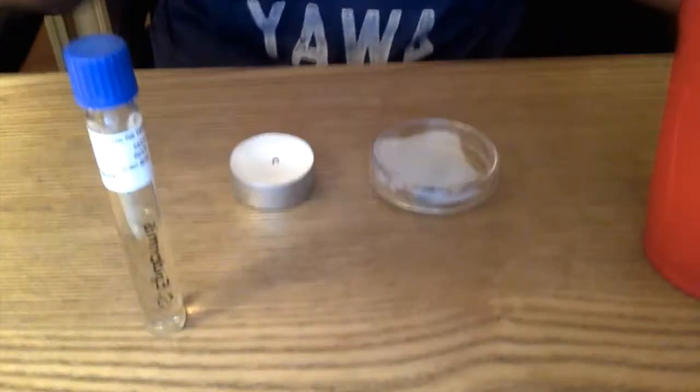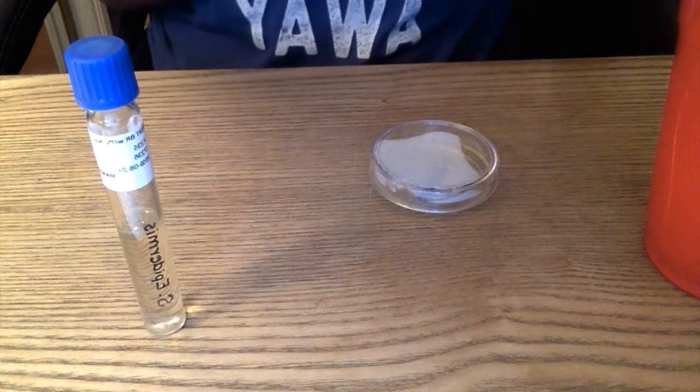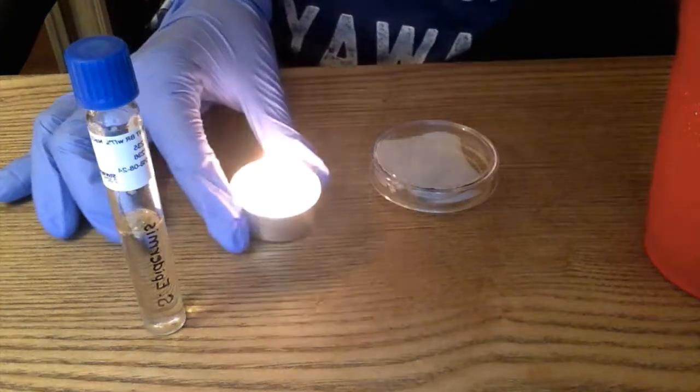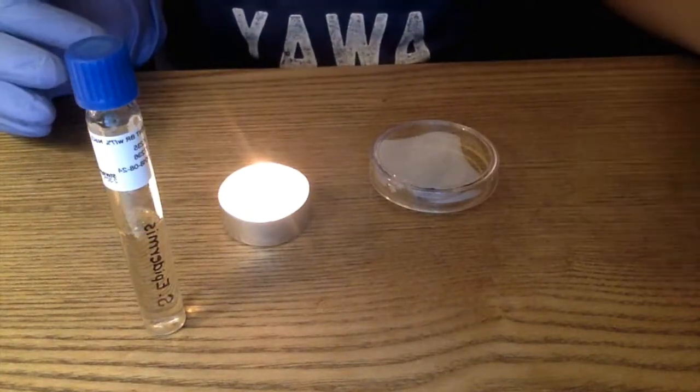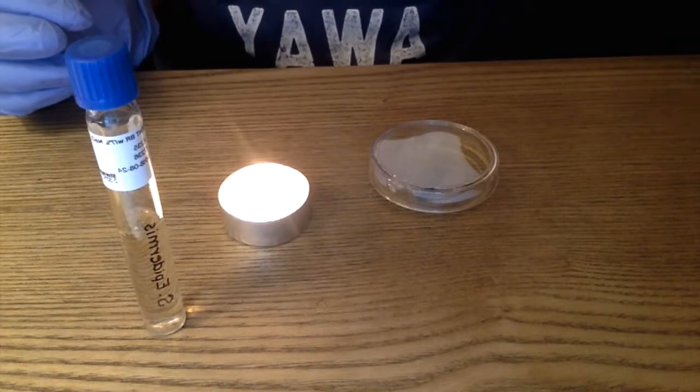So, I'm going to lower this so we can go ahead and get started. First thing I'm going to do, I'm going to try and light this candle. There we go. Just going to be used to sterilize the lip of this broth. So I can go ahead and take out my inoculation loop from the alcohol.